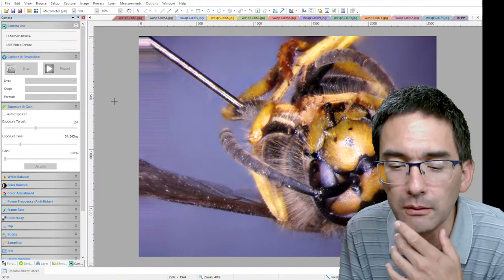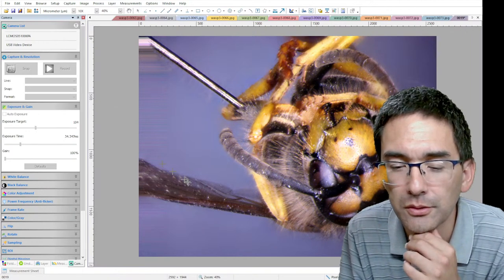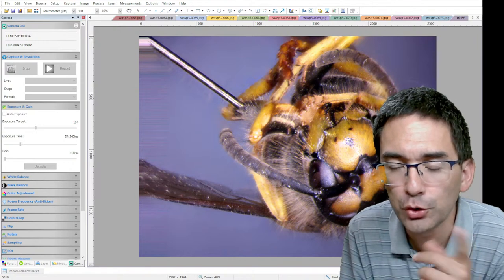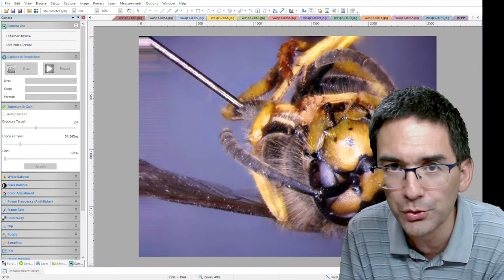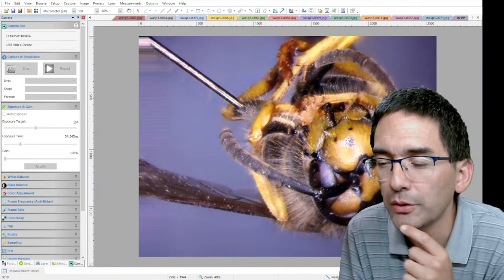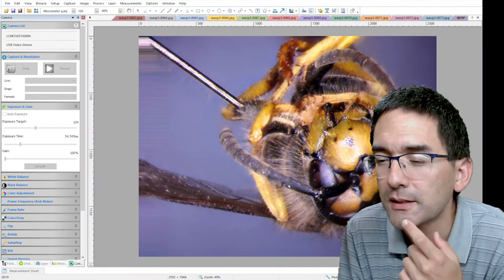That's a possibility. Maybe Helicon Focus has more options here, but I would simply try it out. I'm going to show you now also how this is useful even if you do not have a stereo microscope, because maybe most of you don't have a stereo microscope. So I'm going to show you an example here. I do this with astrophotography.